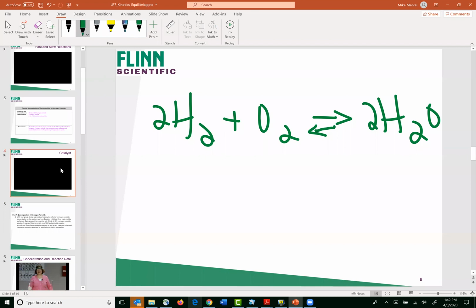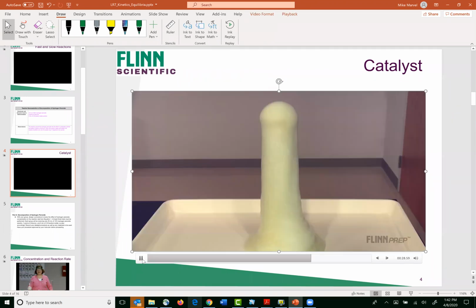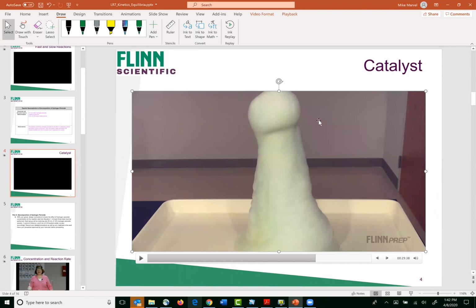So I think I can probably find that. If we go back here, you see how much, when you do this at a high concentration, there's a ton of heat evolved when this reaction is done. A lot of energy is released when this hydrogen peroxide decomposes.